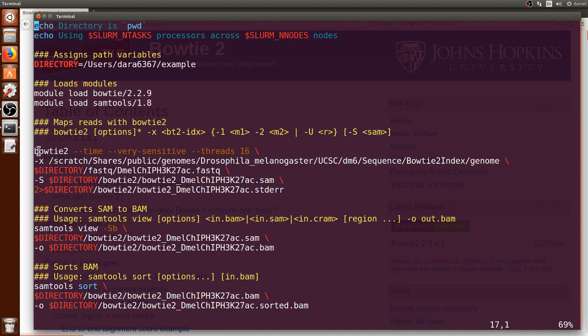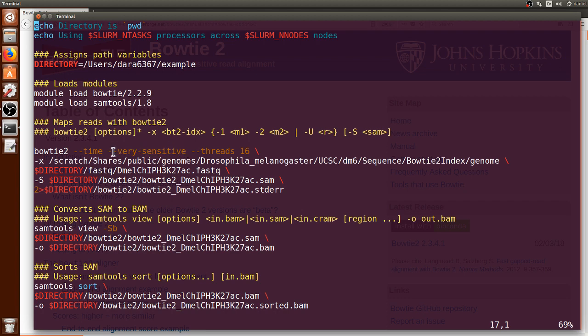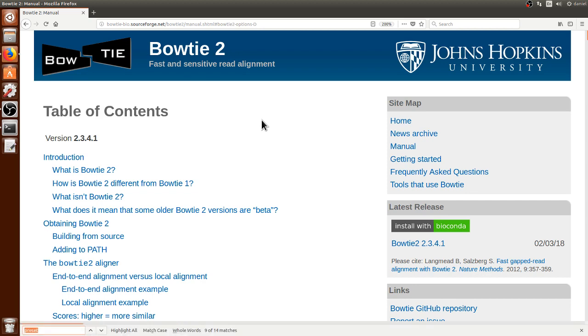So here this is where the Bowtie2 starts and this is the syntax. I am specifying Bowtie2 and then dash dash time such that it would tell us how long it took. And then I'm using dash dash very sensitive which are preset conditions, fast way of putting many preset conditions and I can show you further going to the Bowtie2 official web page.